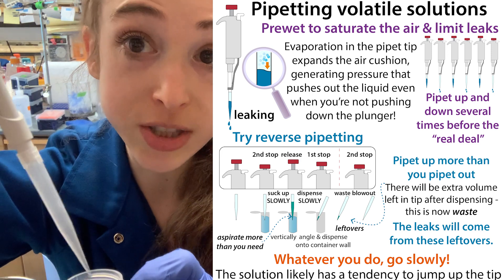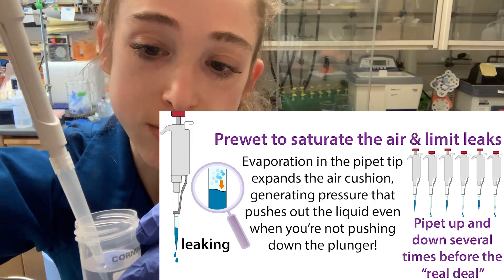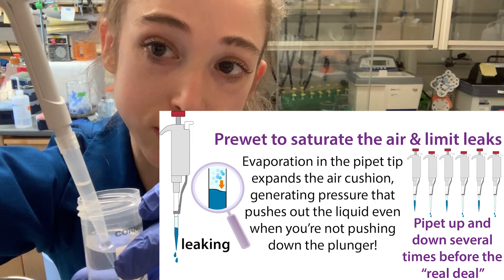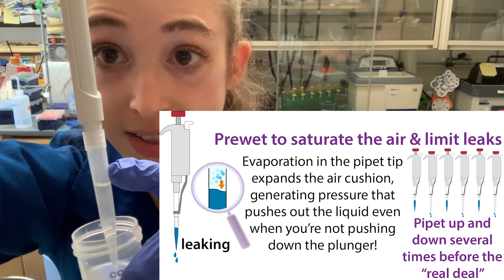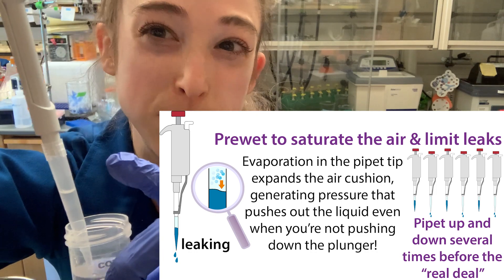To get around this, what you can do is pre-wet your pipette. Basically, you pipette up and down a few times before you do it for real. What this is going to do is saturate the air cushion — it's basically going to make it humid.